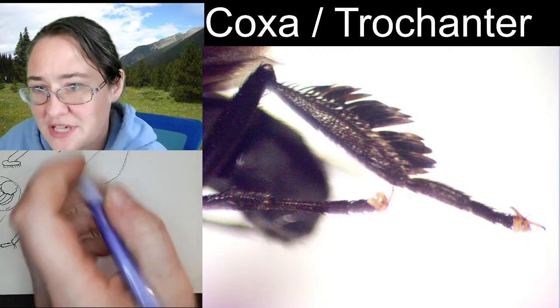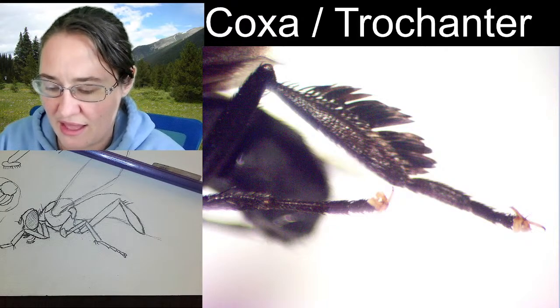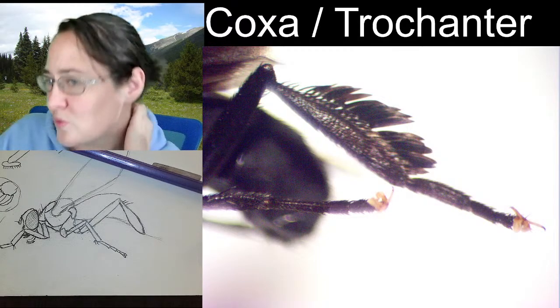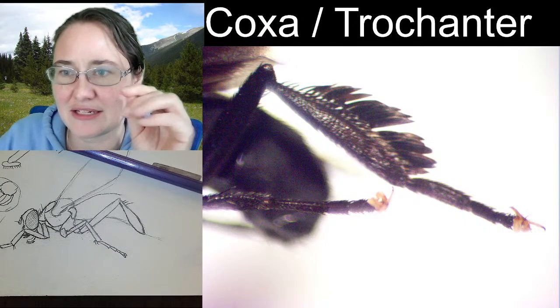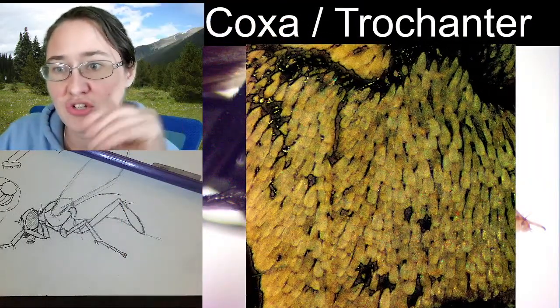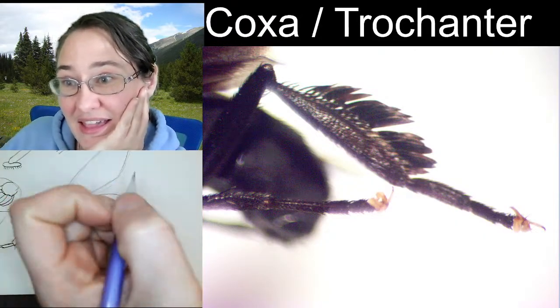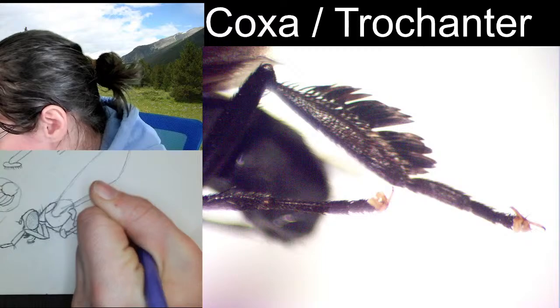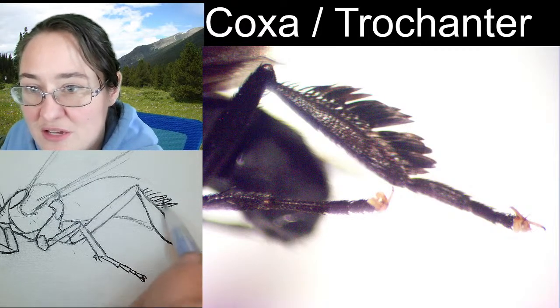Okay, so they start up at the top, kind of narrow, because sometimes setae can be plate-shaped. I have a really good image of a weevil with setae that are shaped like this. Let me go ahead and show you that really quick. That's the reason why I looked a little bit confused, is just because I don't know, fly anatomy tends to have unique words. But this is a microscope image I took of setae on a weevil. And you can see, they're still considered hairs, but they're wide and flat, kind of plate-like. Essentially plate-like like the scales on a butterfly's wing. But when they're in beetles, we do consider them setae. I'm just making sure that they get to be nice and wide here.